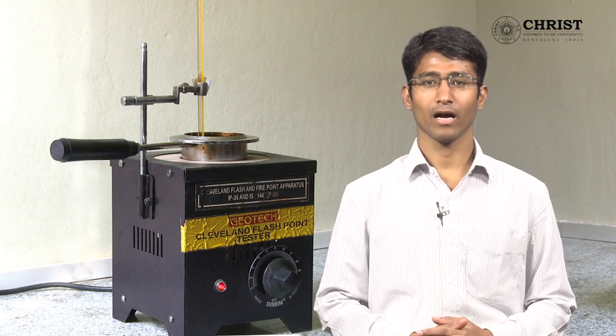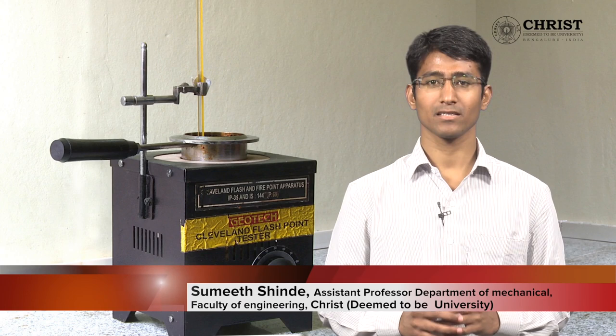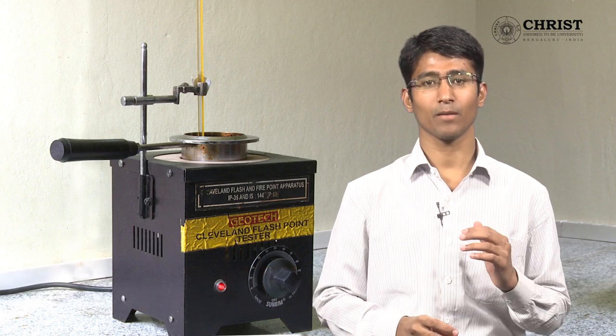Hello students. In this video I am going to talk about the Cleveland's open cup apparatus. This apparatus is used to determine flash and fire point temperature of any given sample of fuel.